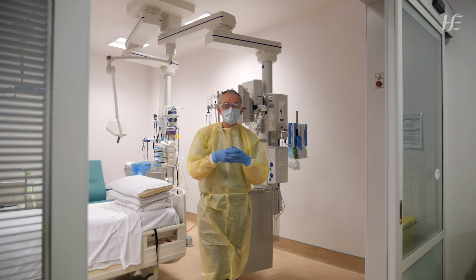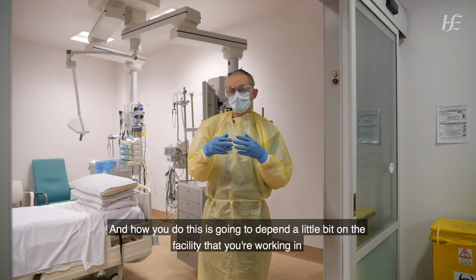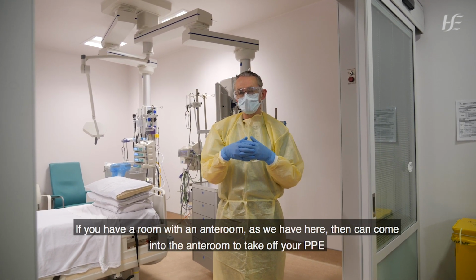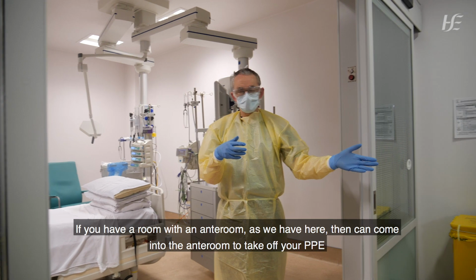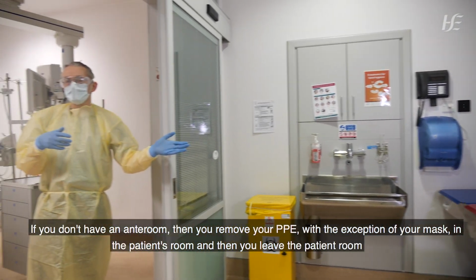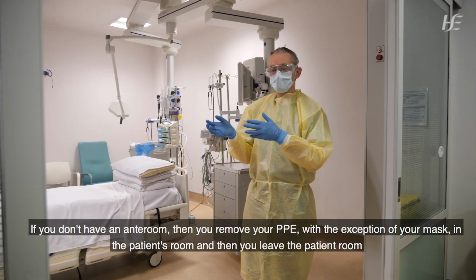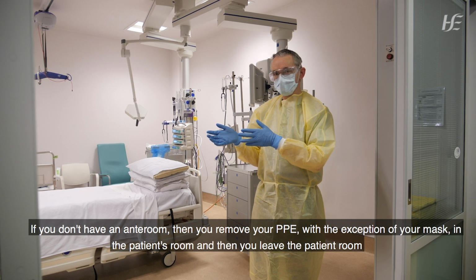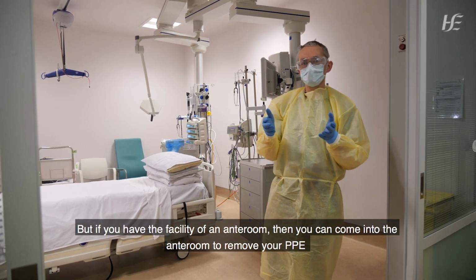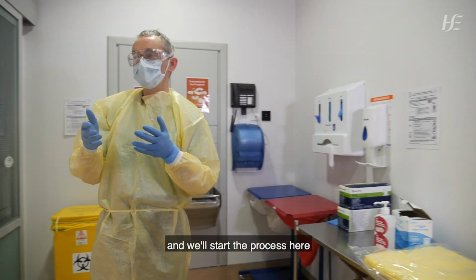Okay, so we're now going to talk about how to take off PPE, and how you do this is going to depend a little bit on the facility that you're working in. If you have a room with an anteroom as we have here, then you can come into the anteroom to take off your PPE. If you don't have an anteroom, then you remove your PPE with the exception of your mask in the patient's room, and then you leave the patient room. But if you have the facility of an anteroom, then you can come into the anteroom to remove your PPE, and we'll start the process here.